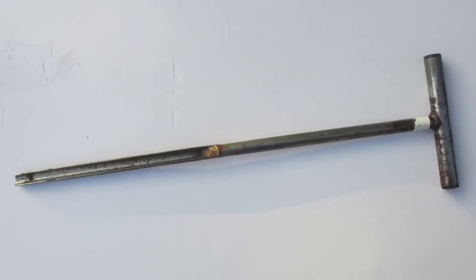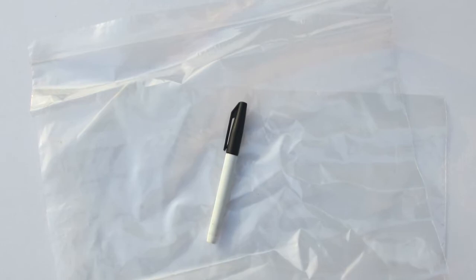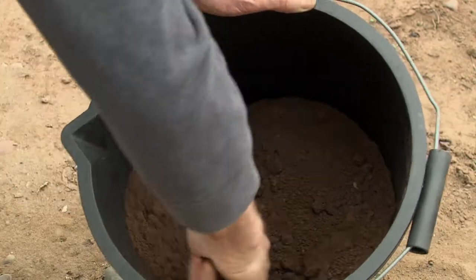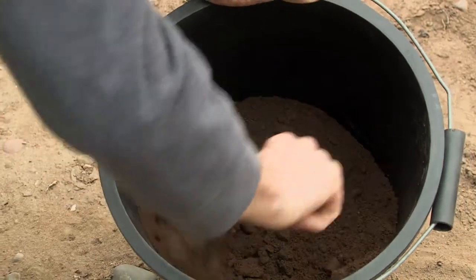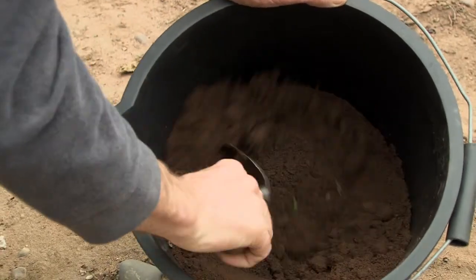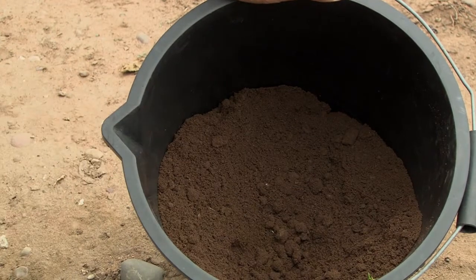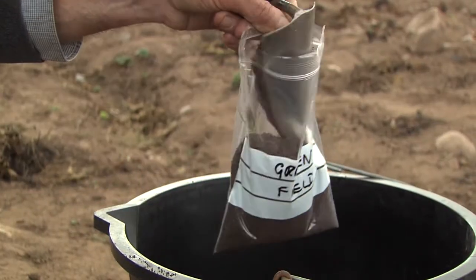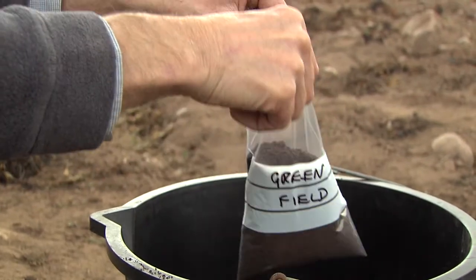Take a soil auger, bags, marker pen, and clean bucket into the field with you. Collect the cores in a plastic bucket to avoid trace element contamination, and mix thoroughly to achieve a well-blended sample before filling the sample bag. 400g of soil — about a good coffee mug full — is sufficient to deliver for analysis.